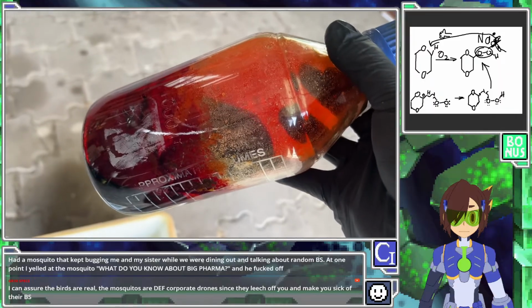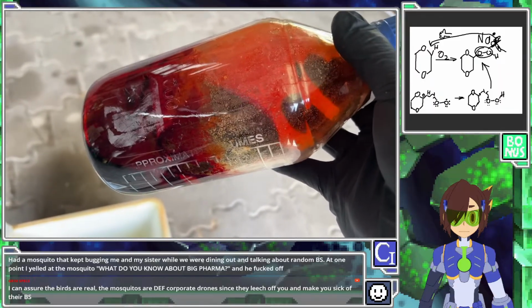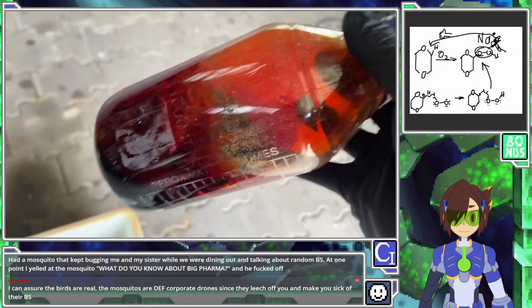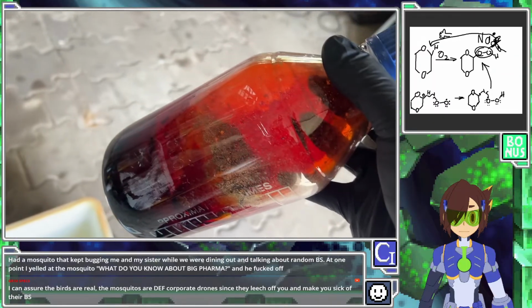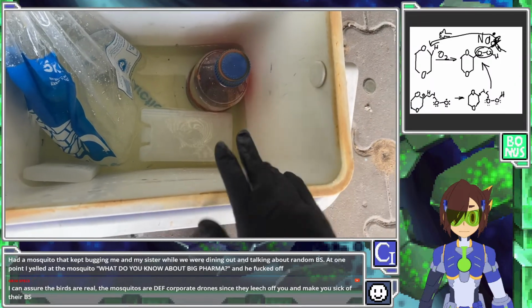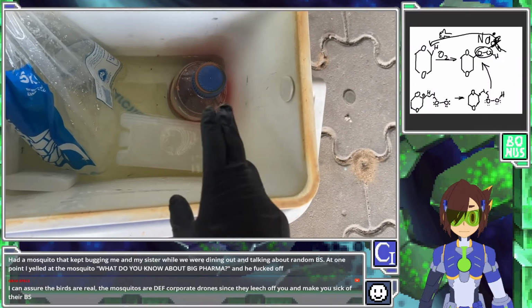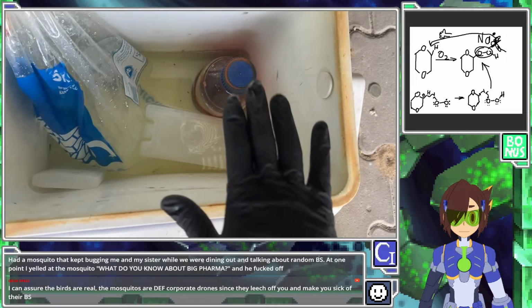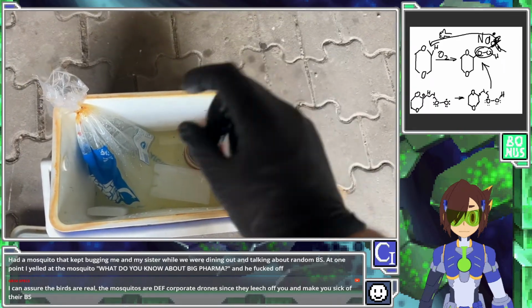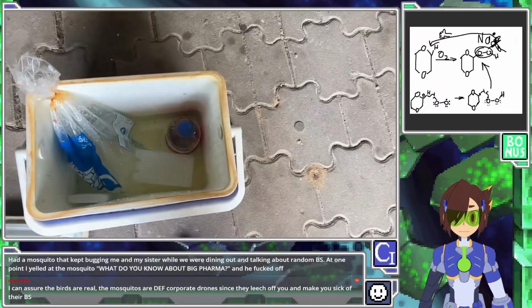Here, so we've got to add some sulfuric acid to dry out the bromine. Make sure there's no water because it's got to be dry before we add it to our reaction. And then distill it again over some sodium bromide, which hopefully removes any chloride contaminants. I could store it in some glass. Obviously, the losses are going to be higher through a stopper or something like that. Or maybe a well-greased stopper was probably a nicer way of storing this, but I was worried about the lid getting shot off as the temperature got really high.